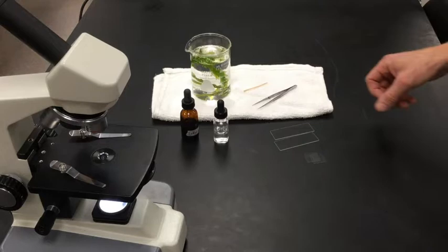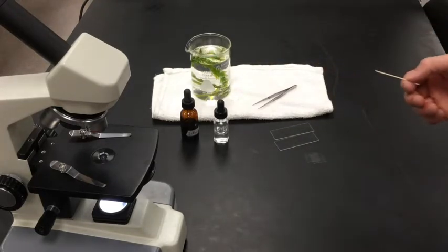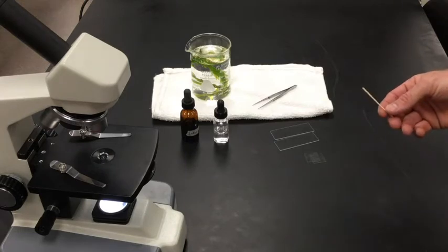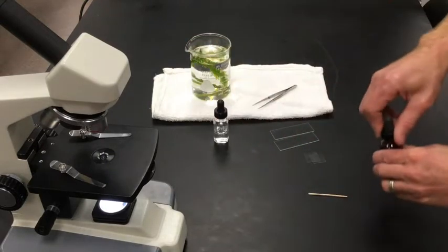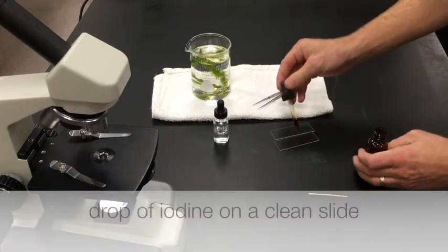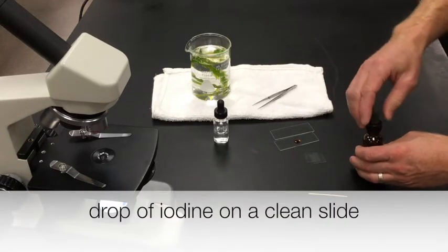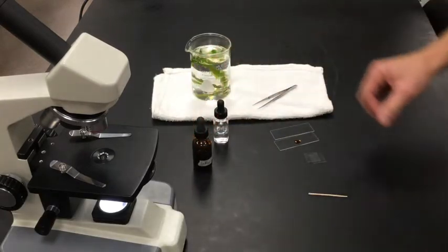To do the first part you're actually going to take a flat toothpick and gently scrape the inside of your cheek with it for 30 seconds. Maybe before you do that it's a good idea to have the iodine — put a drop on a clean slide first. Iodine can stain your clothes and your skin too, so try not to get that on your skin or clothes.